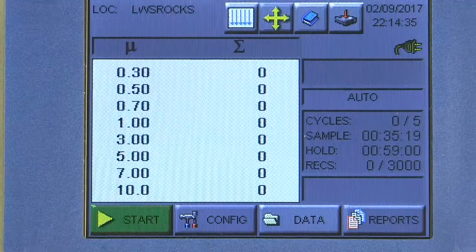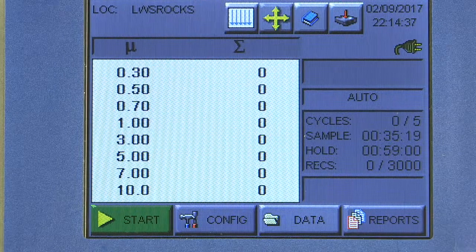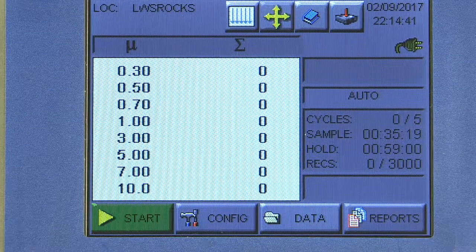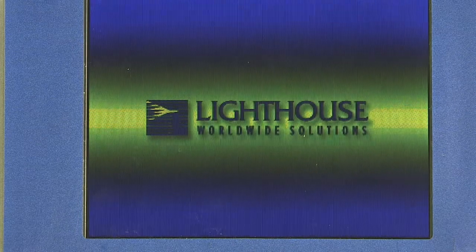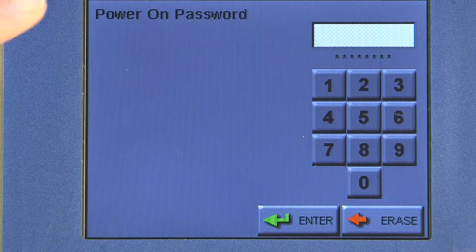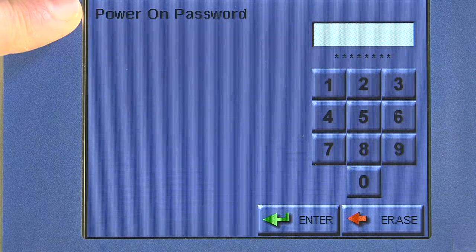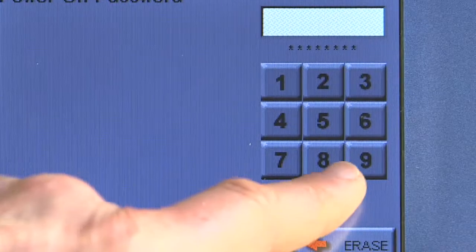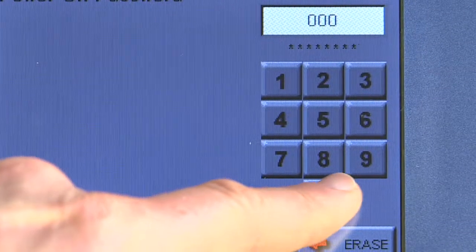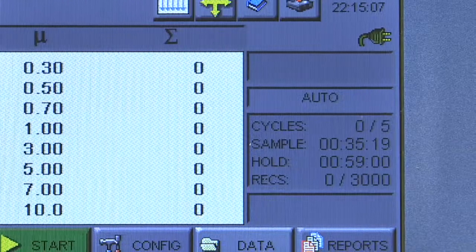If I go back to the main screen and power off the instrument, we'll give it a second to power cycle. When it powers on, you'll notice you have to enter a password before you can use it. So I hit zero zero zero zero and Enter — now I'm in my main screen once again.